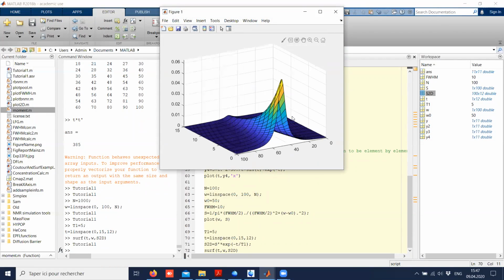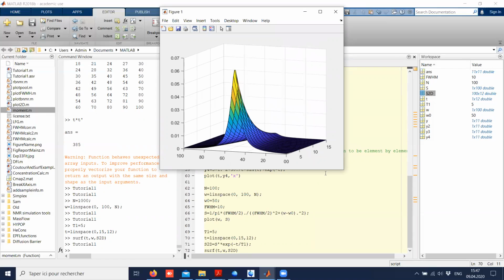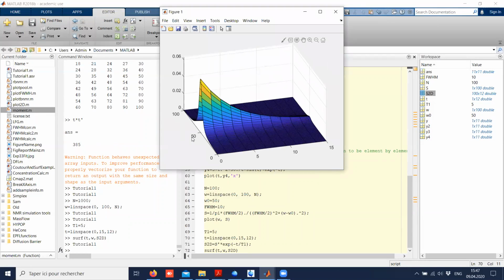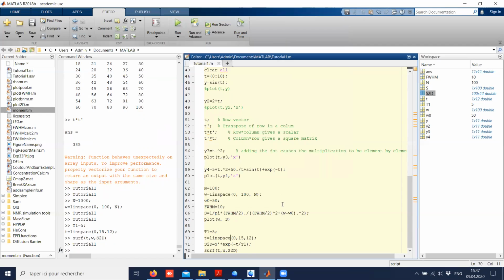So is it clear what is going on here? Do you need any explanation on how I created this object? No, I guess it must be clear. So this shows you a slightly more complicated operation than the first one we've seen.